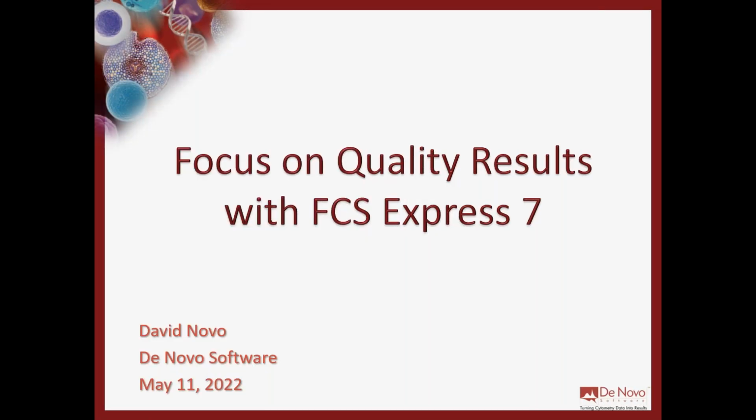Today's presentation is more about how to use FCS Express to support your quality processes that are required in a validated lab, whether that's a GXP lab or a clinical laboratory. So we're going to show a lot of examples of how FCS Express can be used and is used by our customers to streamline and make all of the validation burden much more straightforward, much easier to handle, and much more rigorous than the processes they're doing now.